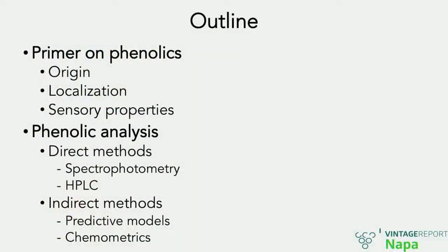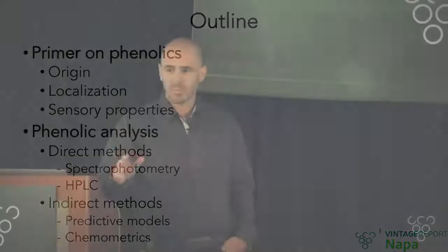In order for me to accomplish that, I would like to give you a brief overview of what we are going to be doing today. First and foremost, here you are going to see three gentlemen, and they are essentially in charge of the three main labs that provide analytical support for phenolics, so you are going to have the chance to interact with them. From my end, I'm going to give you a primer on phenolics, very simple, and then I'm going to spend 3 minutes giving you an overview of how we can actually measure phenolics, particularly here on the West Coast. But I'm hoping the panelists are going to be able to give you more details, okay?